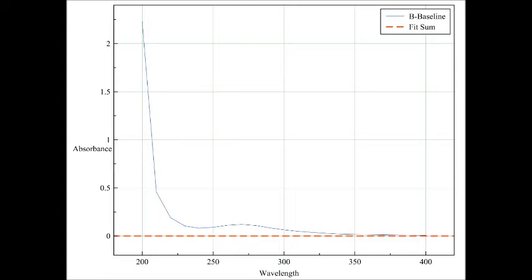And when you do that, you have to use the pure powder with no additives. Anyway, I will have to do this at least two more times to be sure that my data are correct.